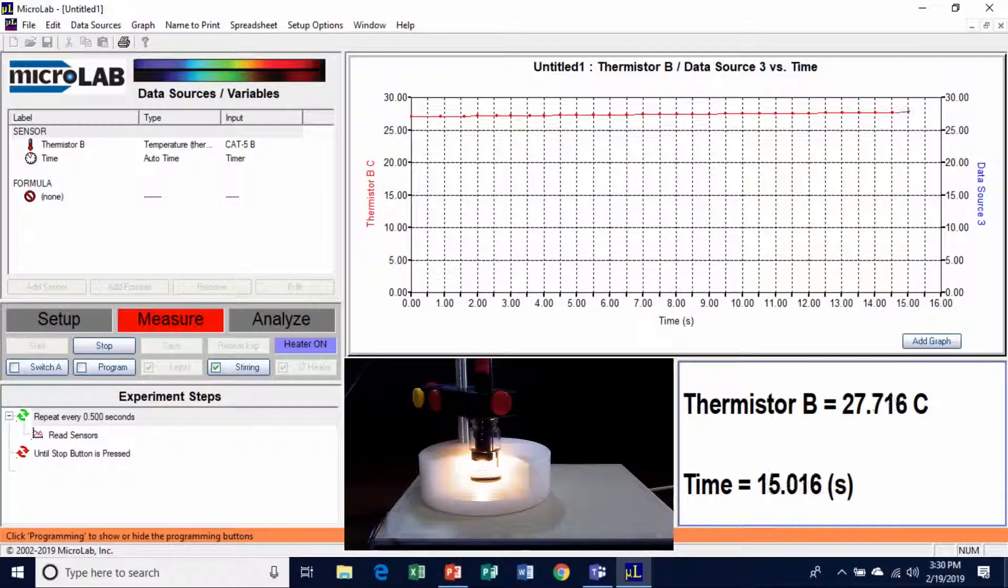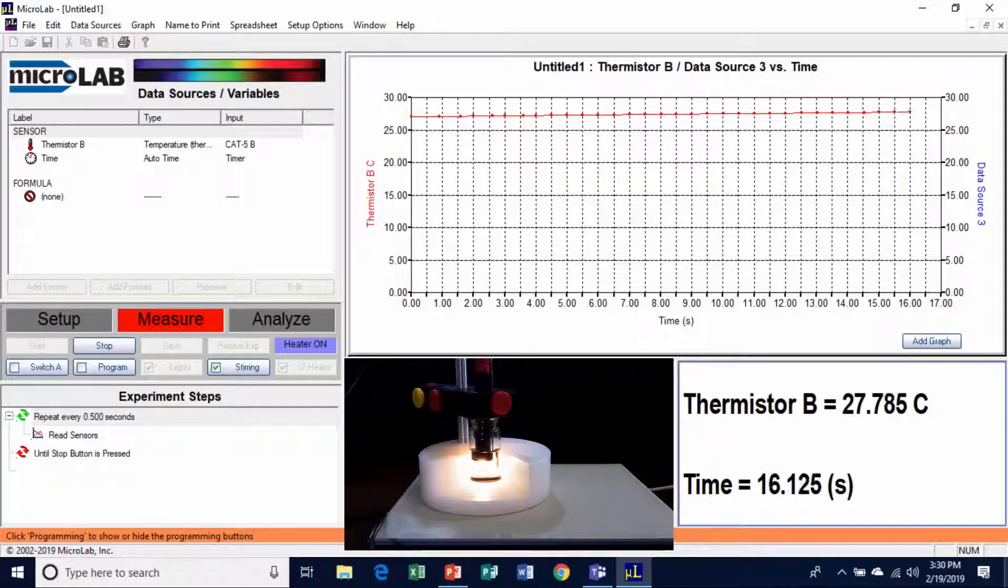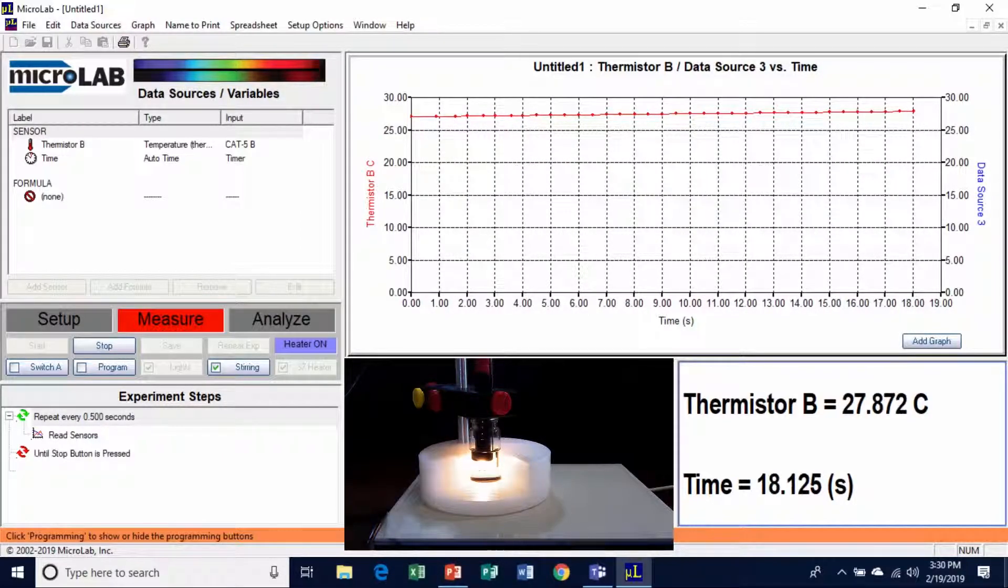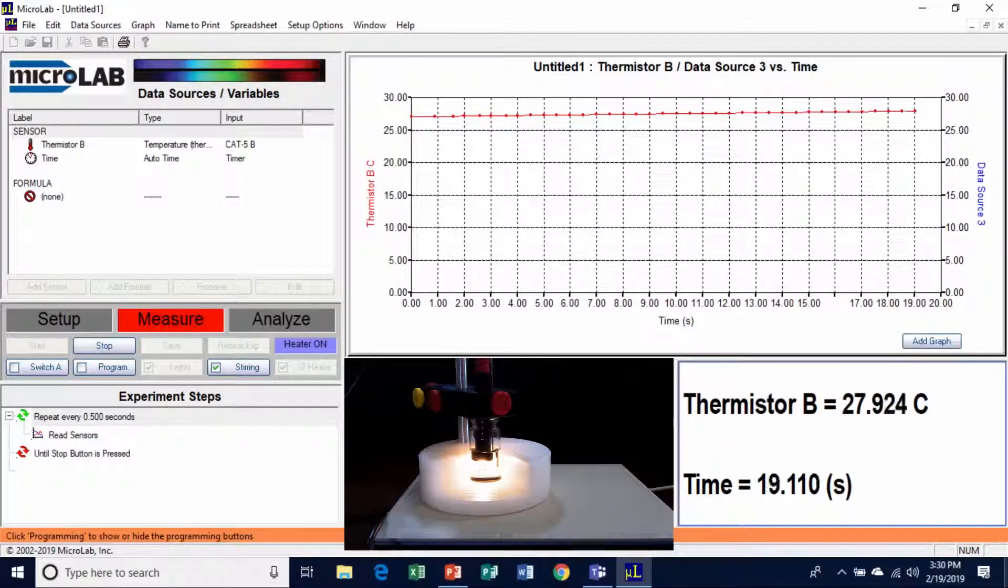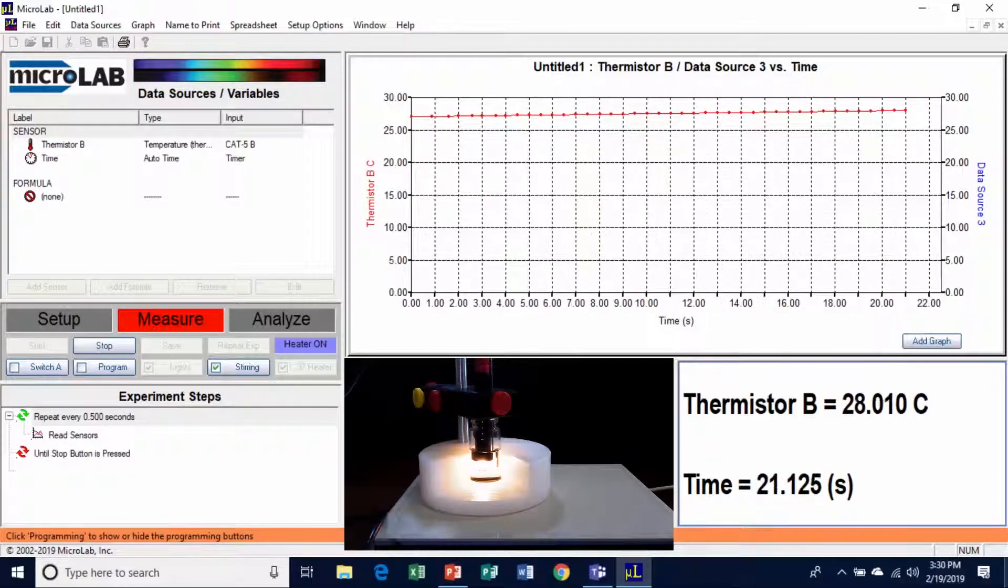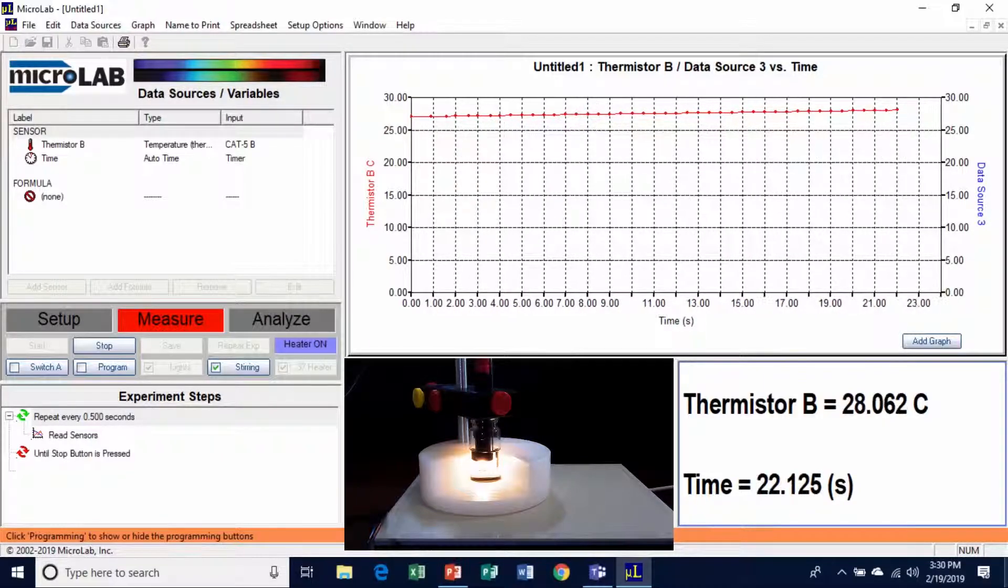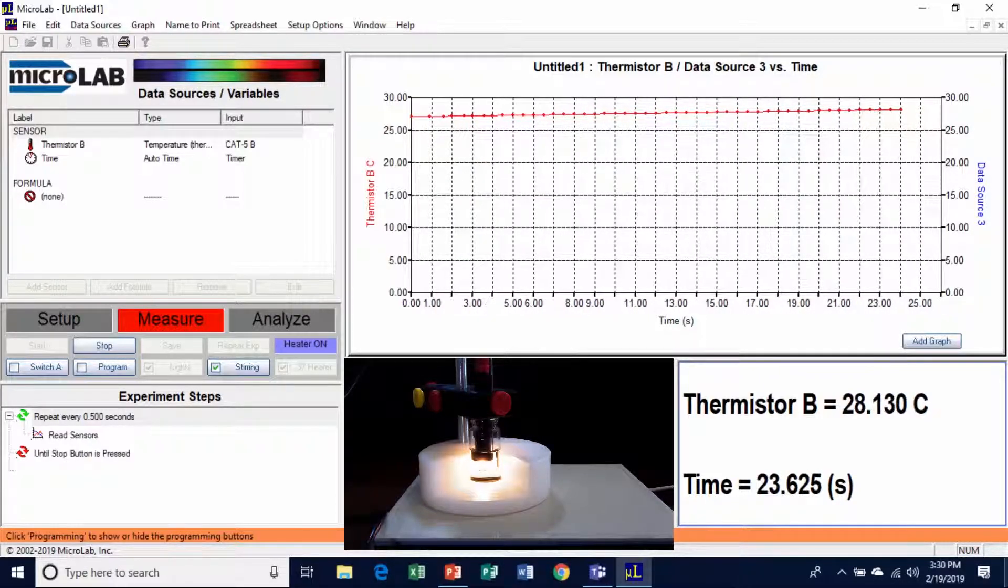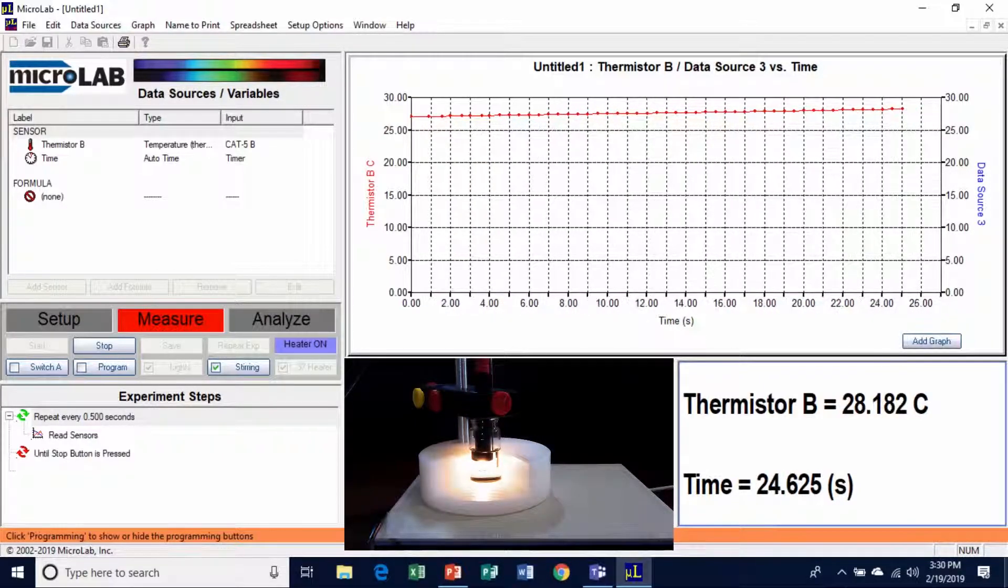I think what we'll do is ask Emory, our video guy, to cut a little bit of the middle of this out in a minute. But we're going to let it run until it gets to above 37 degrees.